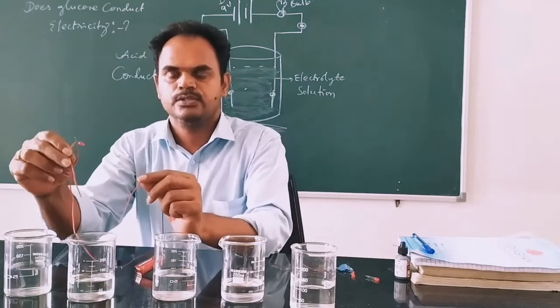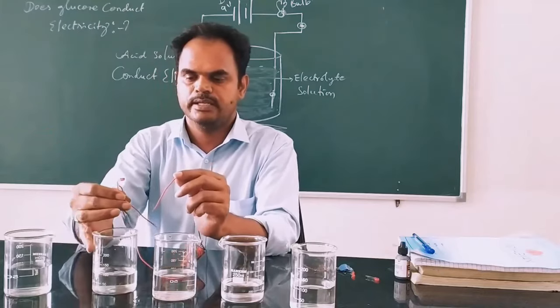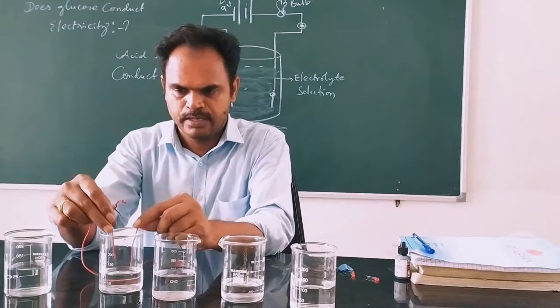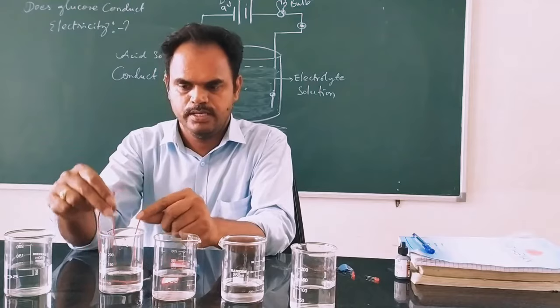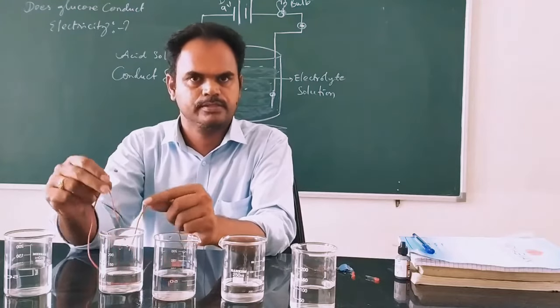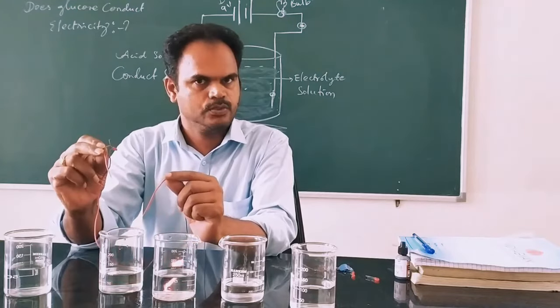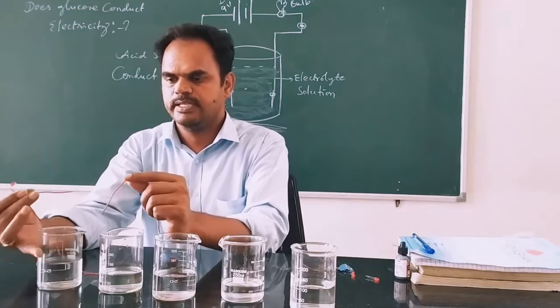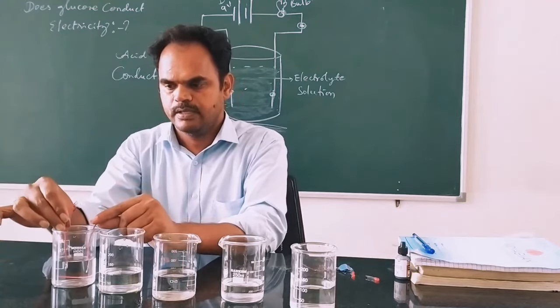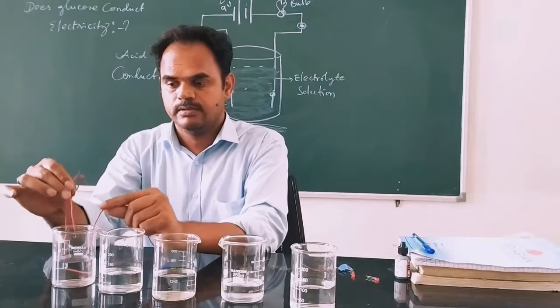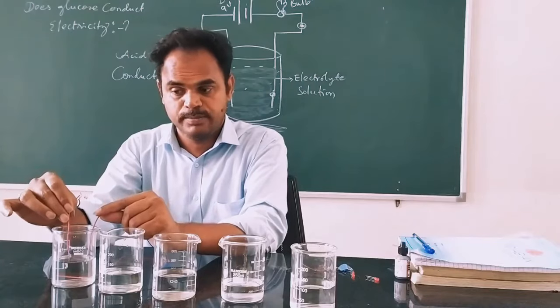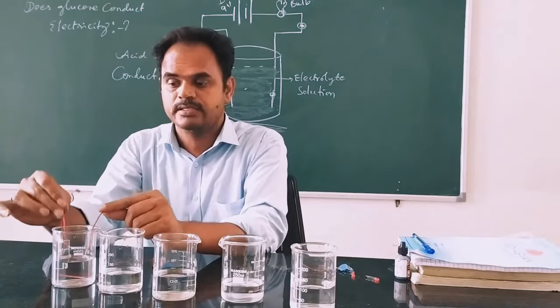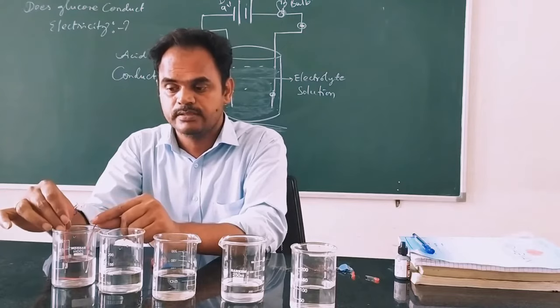The third solution I have taken is dilute hydrochloric acid. Conduction is more here. The last one is acetic acid — sound is coming, light is glowing.